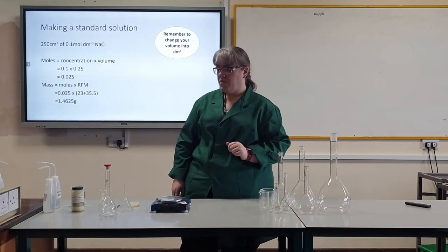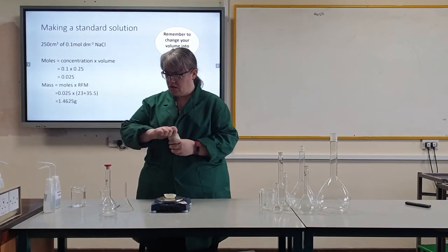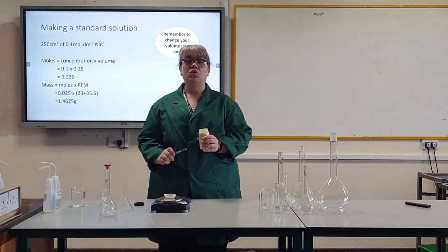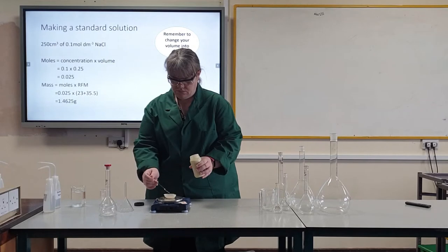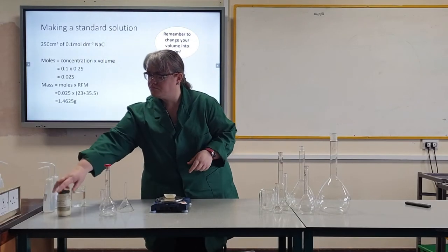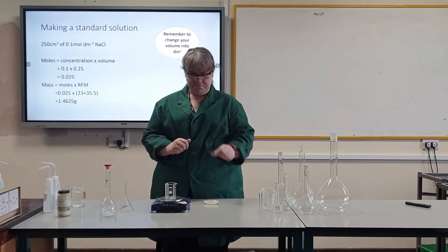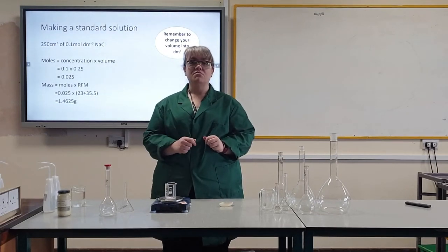So I am now going to create my standard solution. I put my weighing boat on my balance and zero it. I need to have 1.4625 grams; however, my balance does not do 4 decimal places, so I am going to put on 1.46 grams. Once I have weighed that out, I then get my empty beaker, put it on the balance and zero it. Using the weighing boat, I put my solid into the beaker and make a note of that mass of solid.